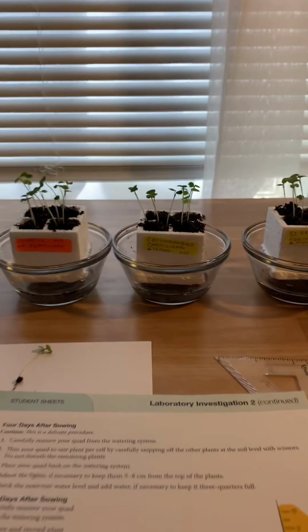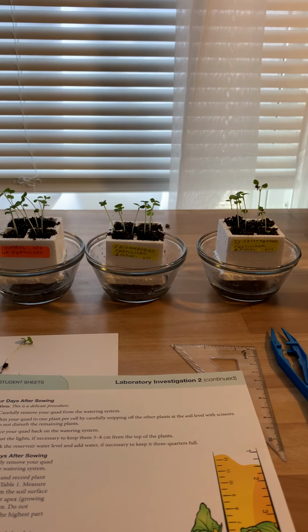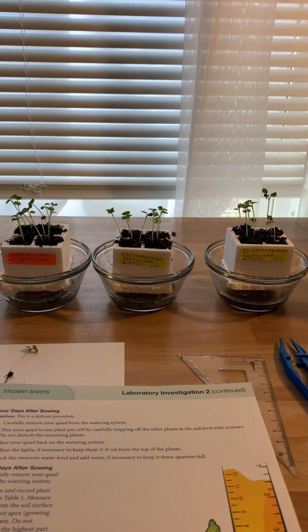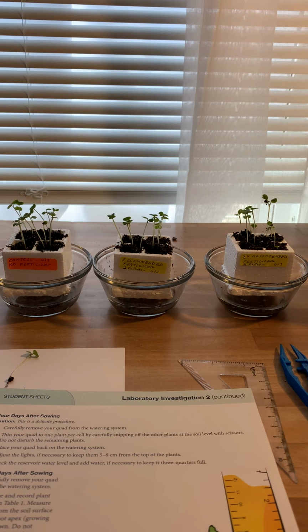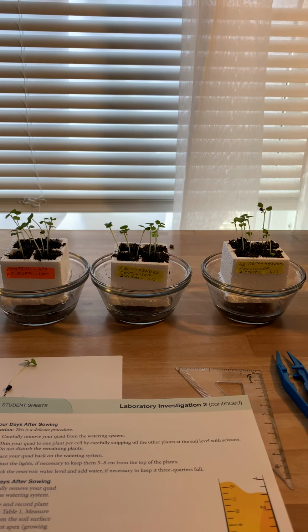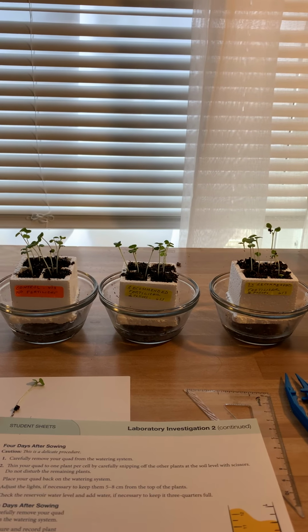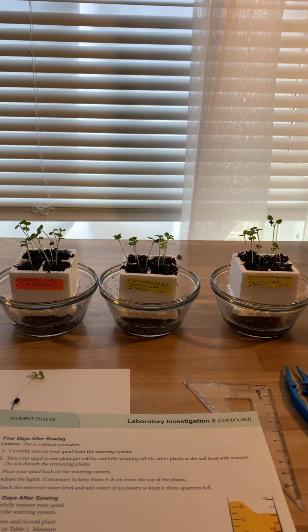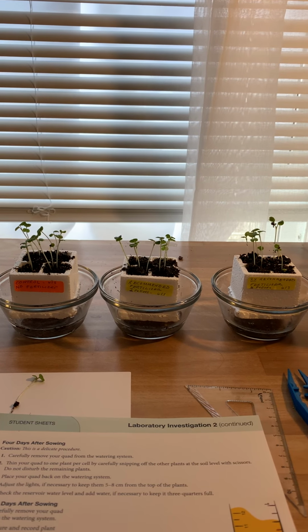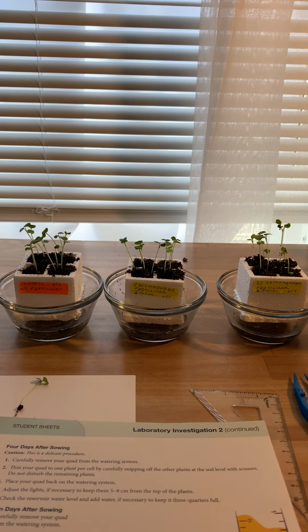Going back to my hypothesis, I thought if fertilizer were added in the proper dose, then the plant growth rate would be the fastest over the time that we're doing our study. Anecdotally, it doesn't really look like that, but we have no data. We just have an observation looking at them. So now it's time for me to thin these out so I can start calculating data.